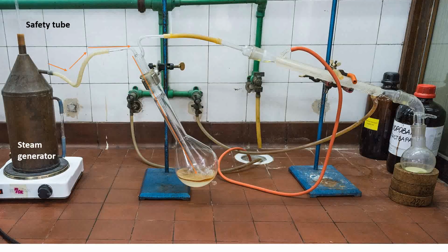Now the mixture to be distilled undergoes boiling and the vapor will be then sent through the delivery tube into the condenser. Inside the condenser, the vapor is cooled and condensed. The condensed liquid is collected in the receiving flask. You may see two layers of liquids.